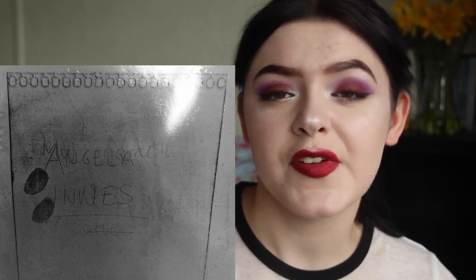Using ESDA is completely non-destructive to the piece of evidence — for example, in the picture you can see there are a couple of fingerprints on the side of it. When you use fingerprinting powder or chemicals to develop latent fingerprints, it's usually destructive to the evidence, so ESDA would be carried out beforehand so you haven't compromised the evidence before doing further analysis.